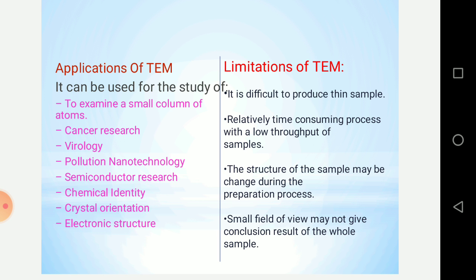the installation cost is very high, so you have to invest a lot in this electron microscope. So these are some of the disadvantages.